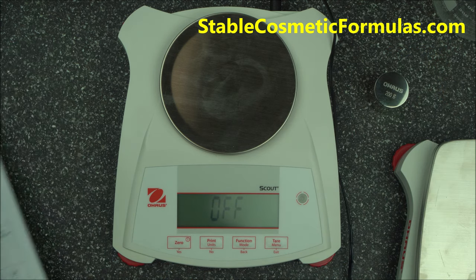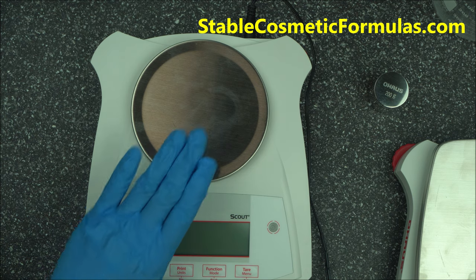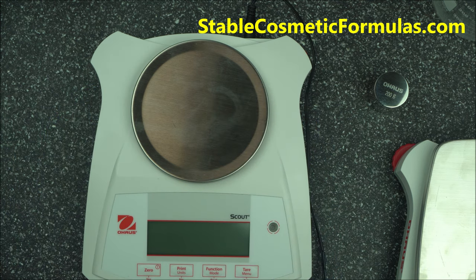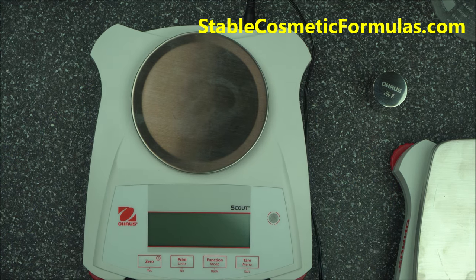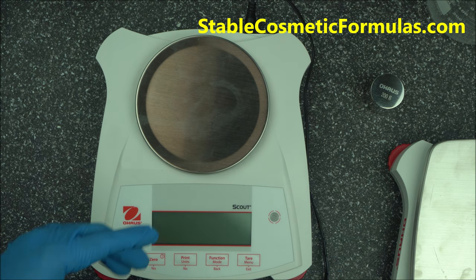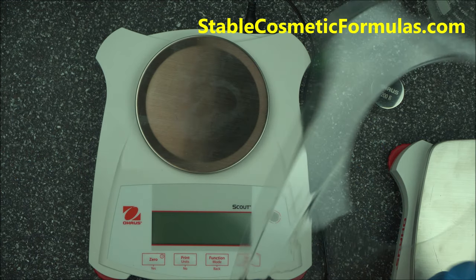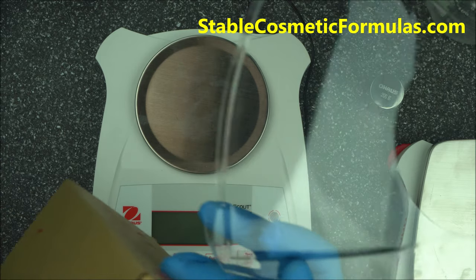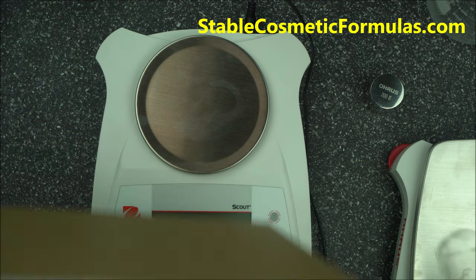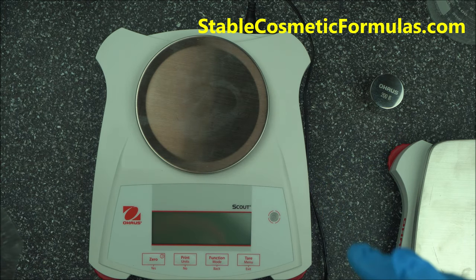Now, how do you protect your SPX Scout? If you're working with water, you want to protect it and make it last. Get a cover — it's called the In-Use Scout Cover, made for the Scout brand. Different types of this scale have different covers, so make sure you get the one that matches the model you bought.